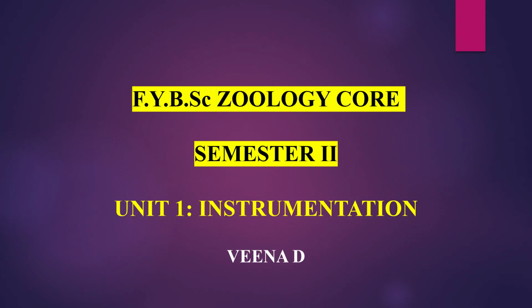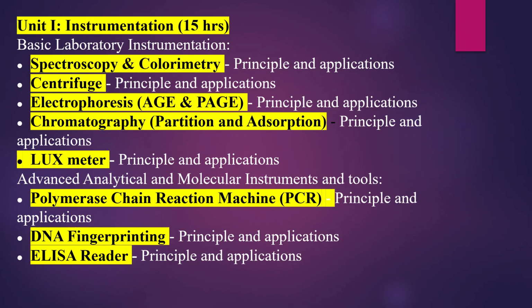Today we are going to start with one interesting topic, that is instrumentation. And in this instrumentation unit, we are going to first talk about a technique called electrophoresis. Okay, we are going to talk about electrophoresis.